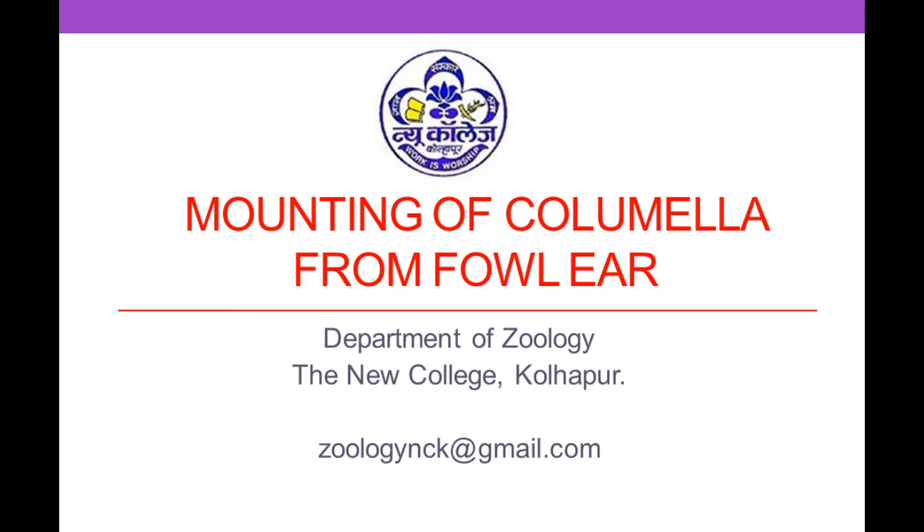Hello dear students, this is the video of mounting of columella from fowl ear. It is prepared by Department of Zoology, the New College, Kollapur.